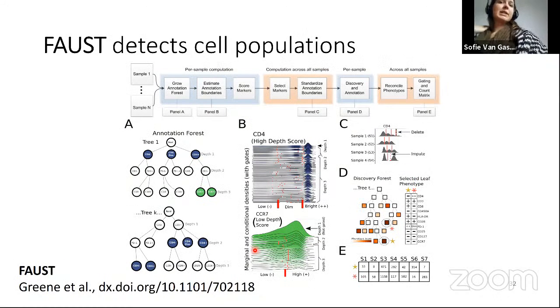A slightly more recent method is FAUST. That was recently proposed. I think one of the interesting things here is that it will try to find all these splits of interest. It will also do it in an exhaustive way, so not only looking at the splits you decide upfront will be of interest, but looking at all things that are going on. And it will have some steps that are approached for every individual sample, and then some steps that bring it all together again across the samples.